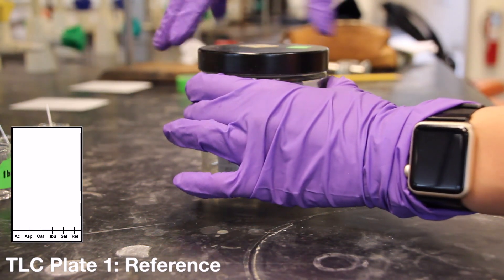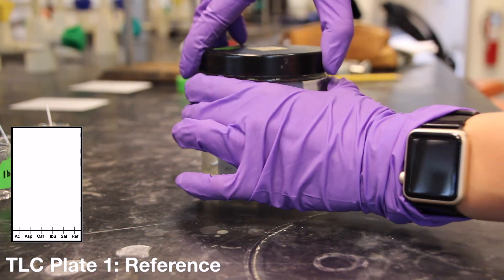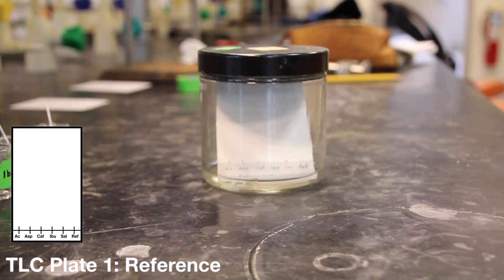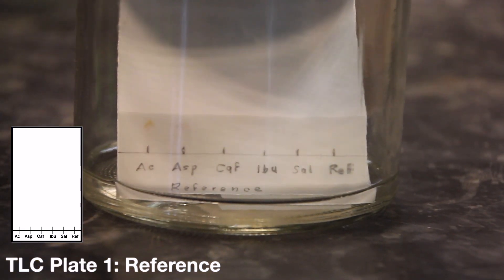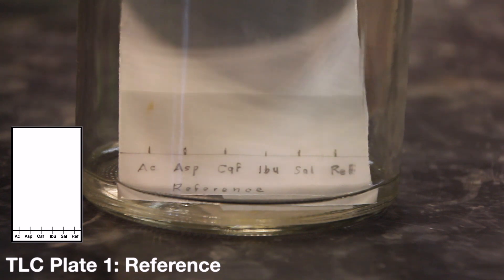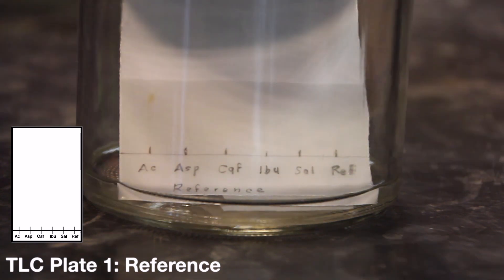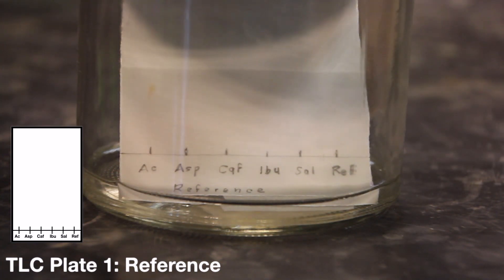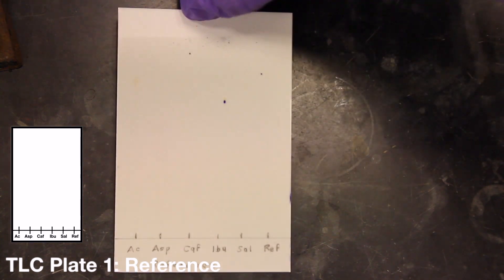Close the jar and allow the plate to develop. It is important not to move or shake the chamber while the plate is developing. Once the solvent level has risen to a level of about 0.5 cm from the top of the plate, remove the plate from the chamber, and using a lead pencil, immediately mark the position of the solvent front.